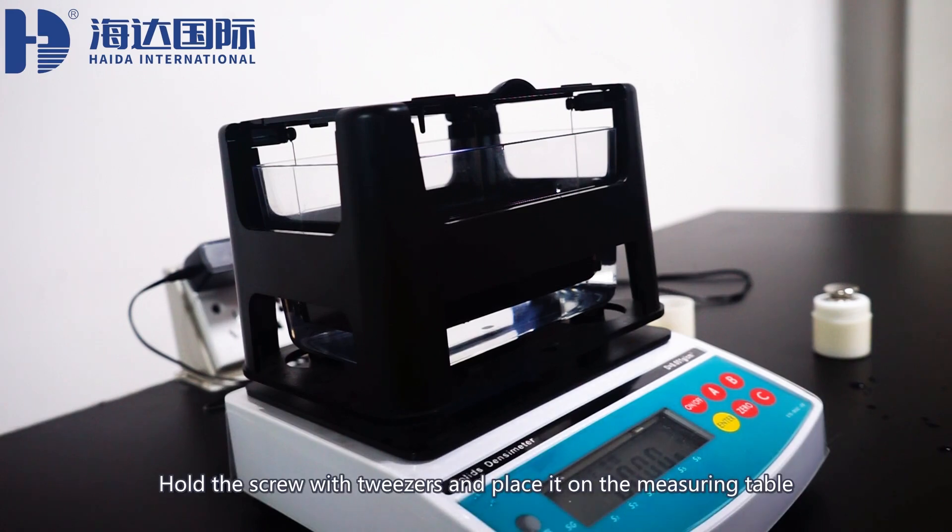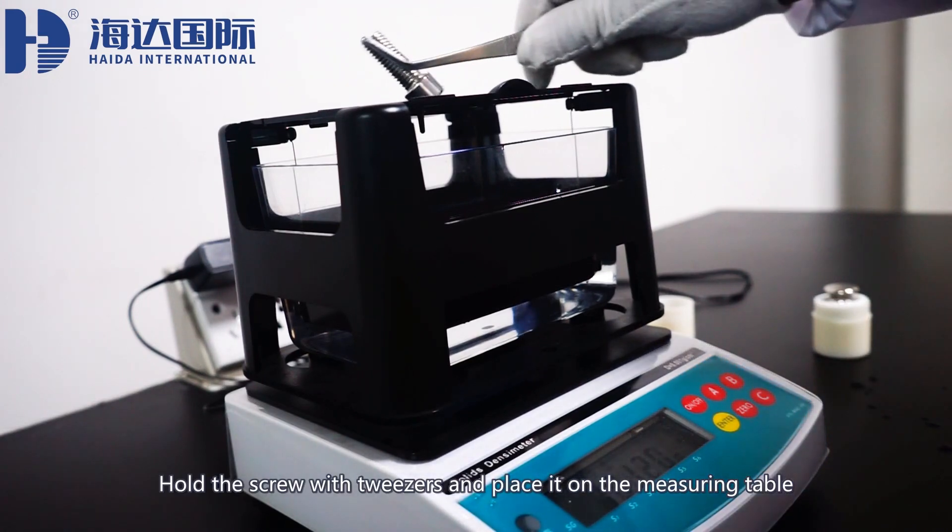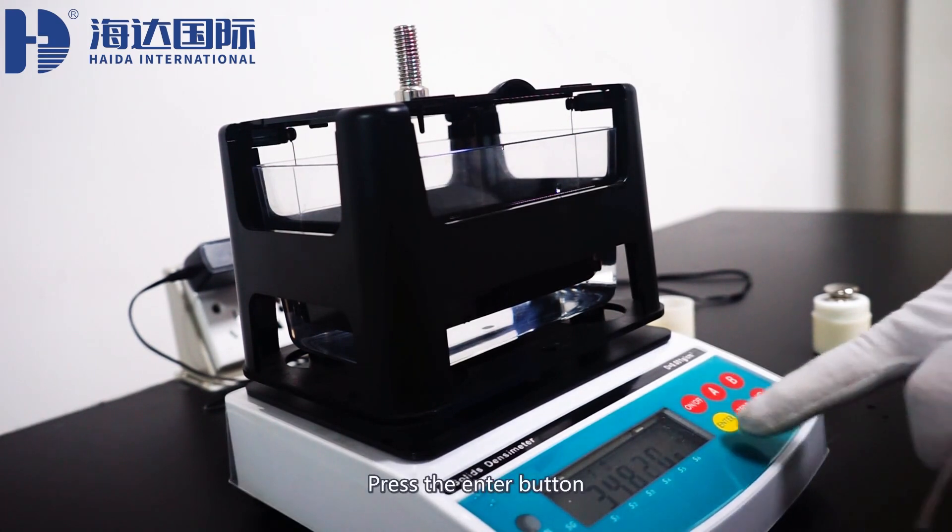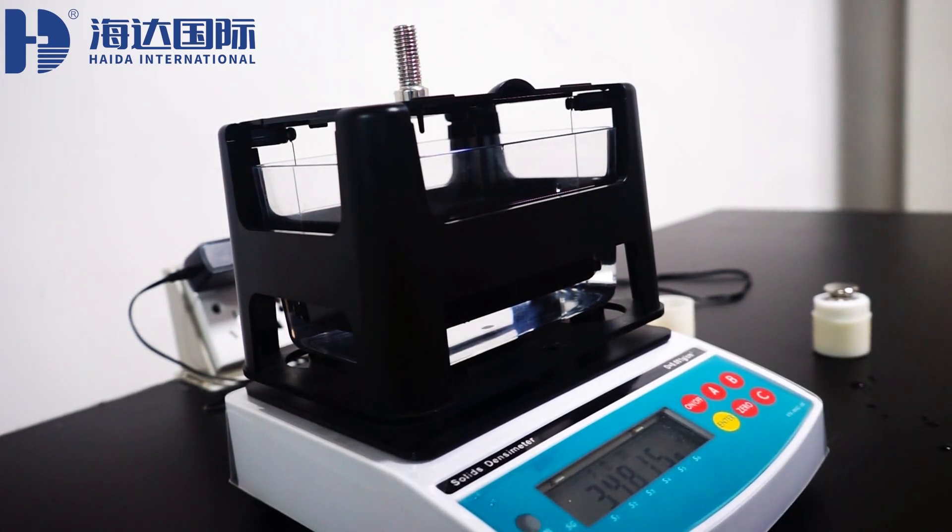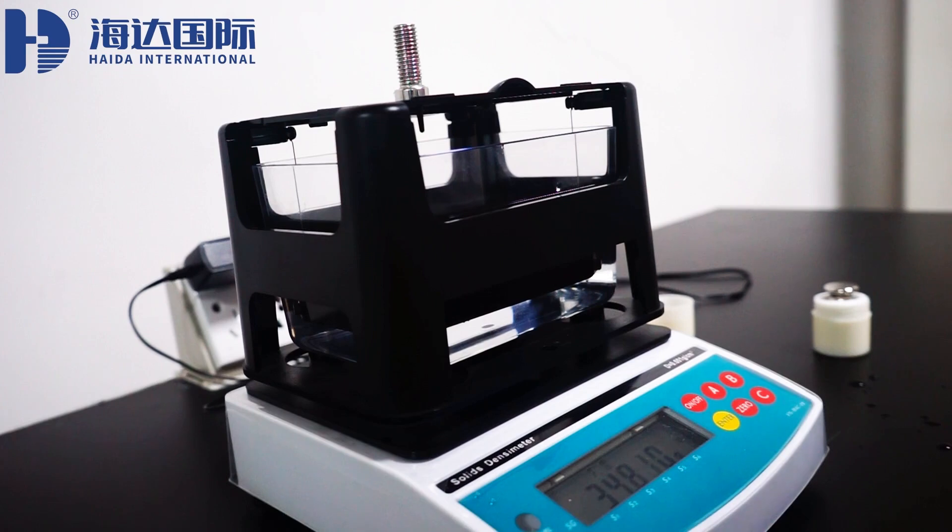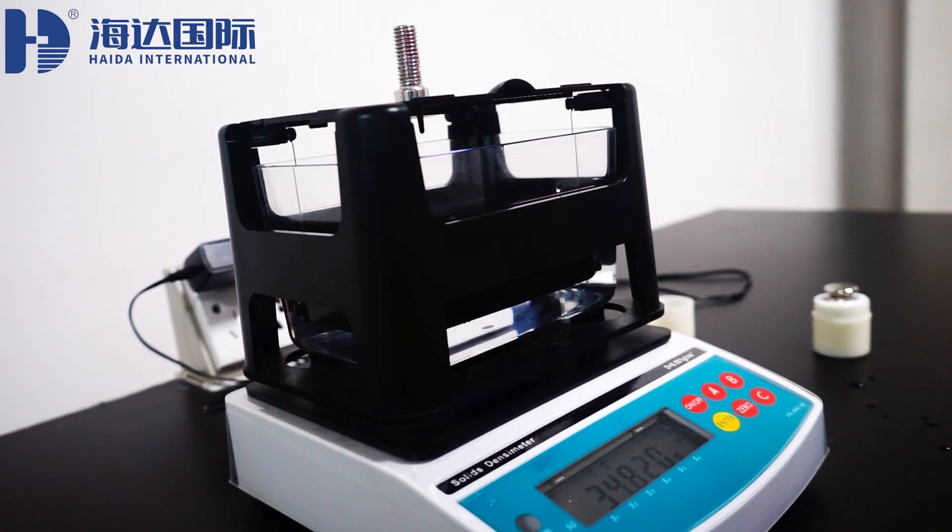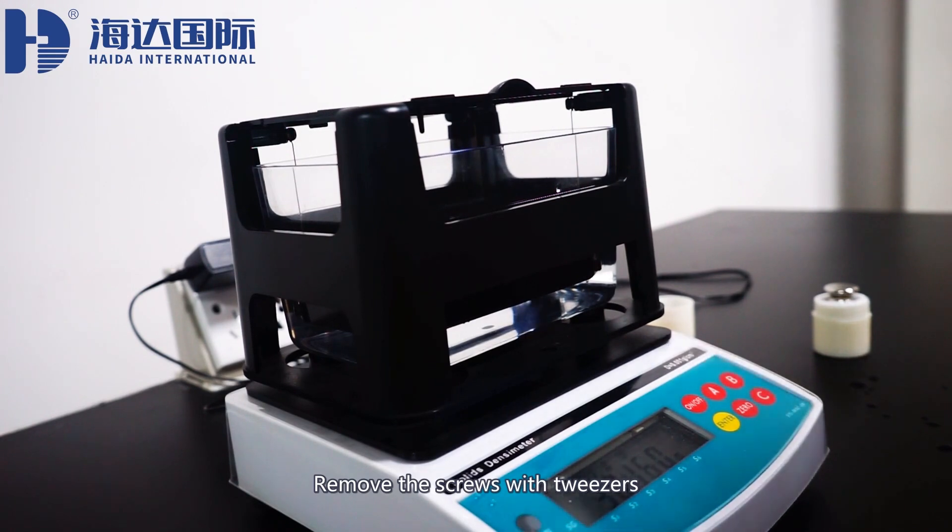Hold the screw with tweezers and place it on the measuring table. Press the enter button. Remove the screws with tweezers.